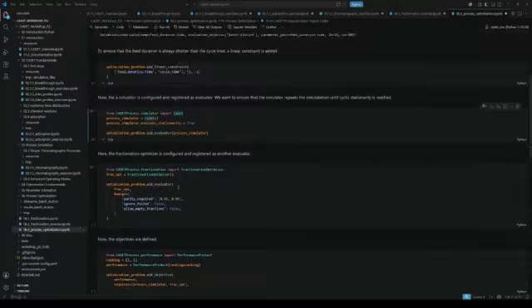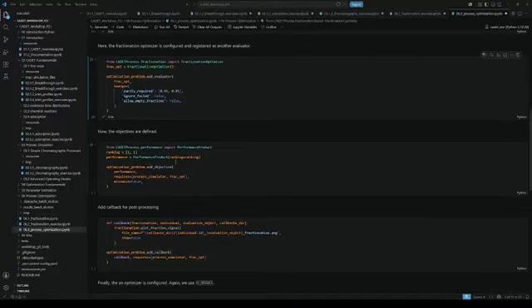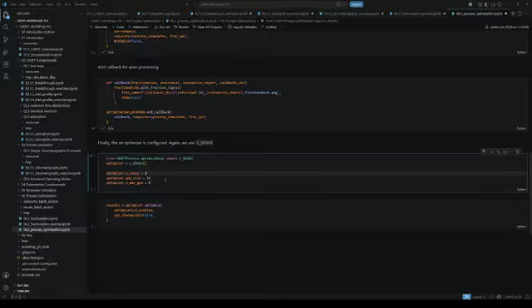We then load our simulation and we set up some target parameters. We want to achieve purities for both components in the system, A and B, of 95%. And here we have some ranking matrix. So this is how these results are evaluated. And then at the end, we're going to set up our optimizer. So we'll be using an automated optimizer, U_NSGA3.